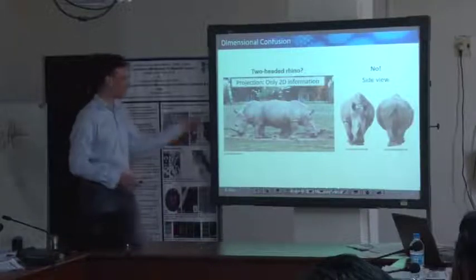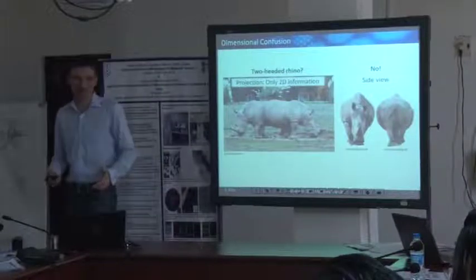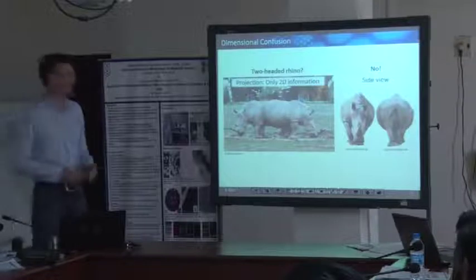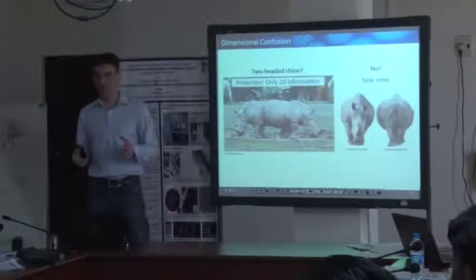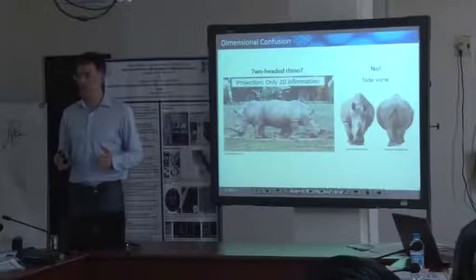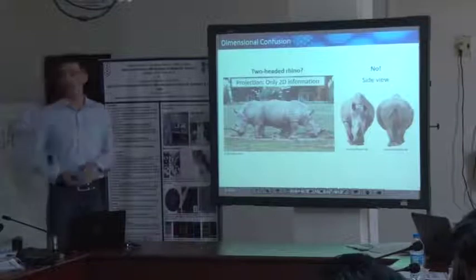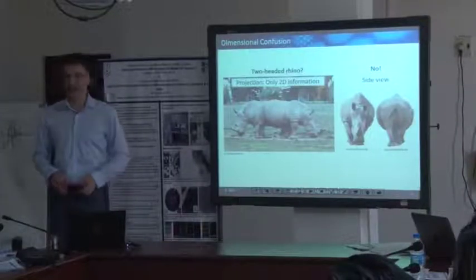This was just the front view, and this is how it looks from the side. It's quite obvious for this particular case. But in material science, there are many examples where, because we only see our sample in projection, it's not really clear what's up and what's down in the sample. So in that respect, we need some 3D analysis.